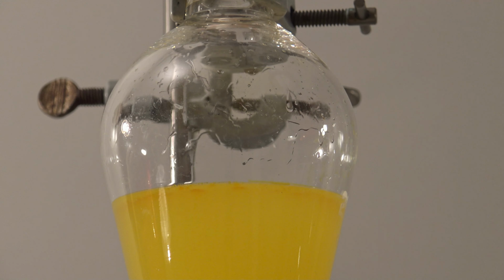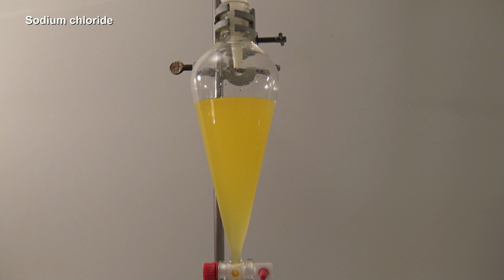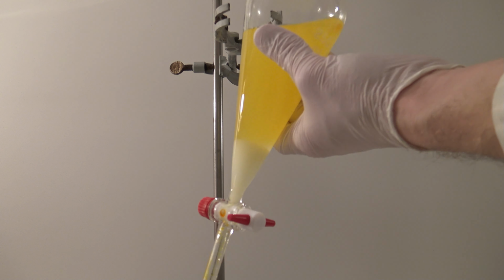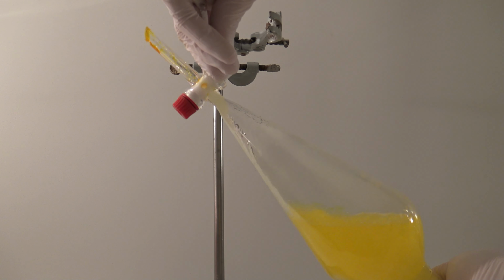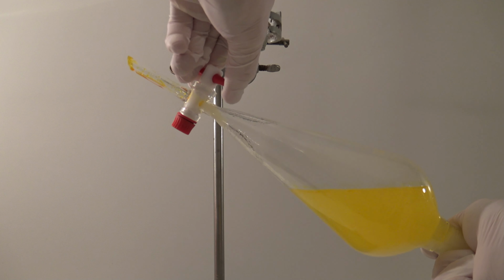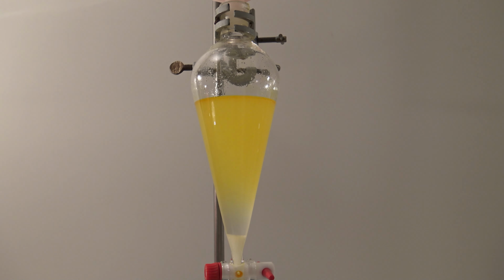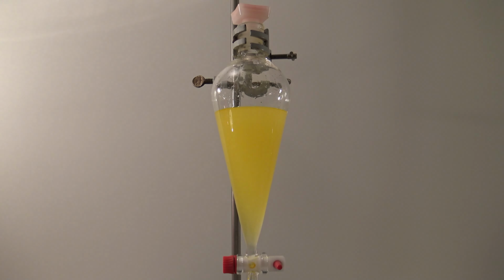Nevertheless, there was still no good separation of the layers, so a large amount of sodium chloride was added. The sodium chloride dissolves in the watery layer and increases its density. This leads to a quicker and better separation. The exact amount is not important, and due to the high solubility, a fairly large amount can be added without saturating the watery layer. Even an excess on the bottom is not a big problem. To see if the excess dissolves, it was shaken again afterwards. Then the layers could be separated.